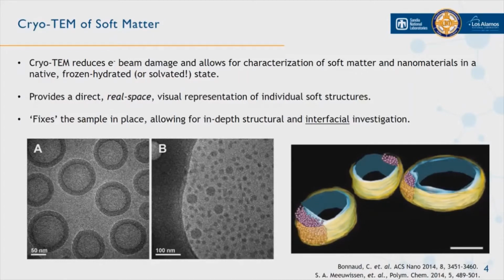So this is a powerful tool for capturing the dynamics of the particle system, but it's been limited for soft matter, originally caused by the increased electron path length through the liquid coupled with typically low contrast. Liquid cell TEM is also limited in probing materials interfaces due to sample movement under the beam.